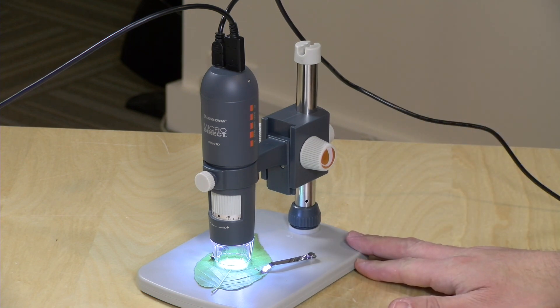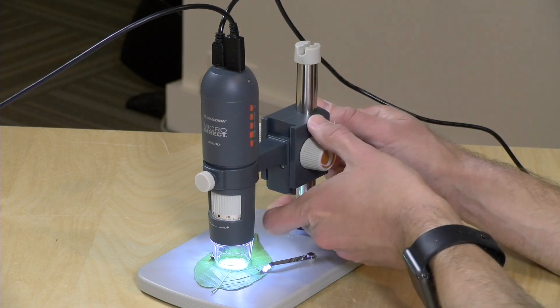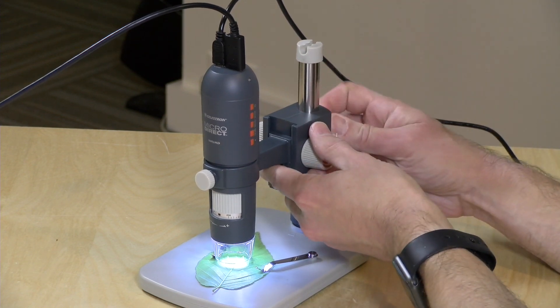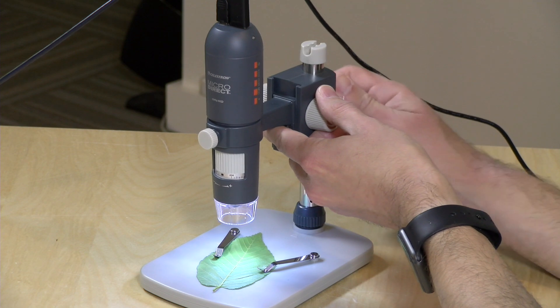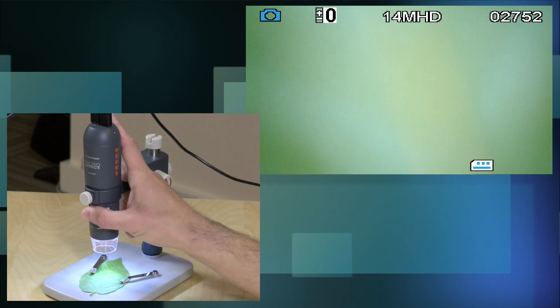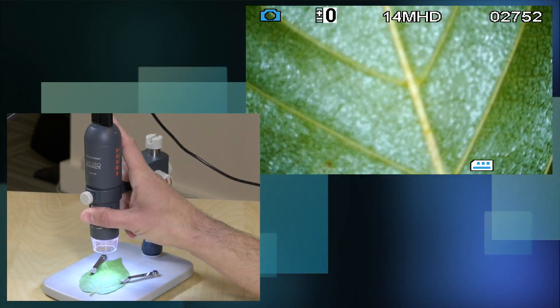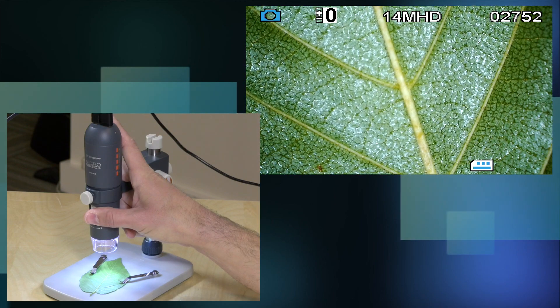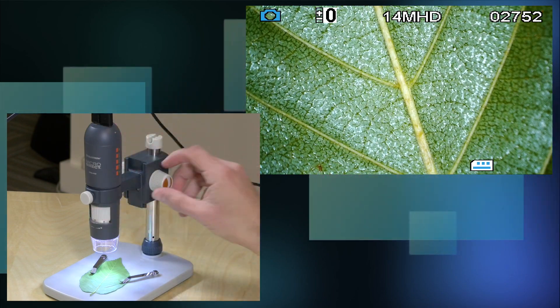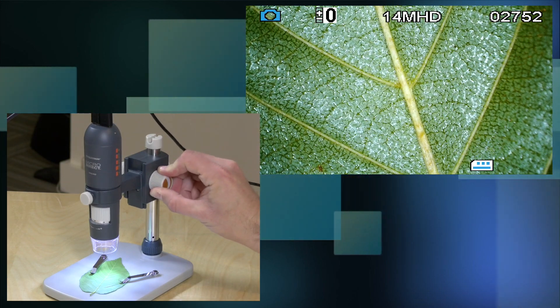The hardware itself costs about $180. It's a pretty decent little stand — it can give you some good motion up and down off of the base. So if you wanted to get a wider angle, for example on the leaf here, you can turn down the magnification. You've got some range of motion in the magnification, and then you can adjust this dial here to more finely focus the image.